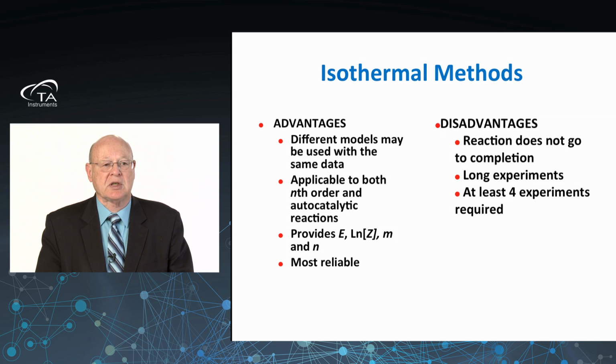Isothermal experiments will typically take about a day to perform for each one. We need at least 4, so we're looking at experimental times approaching a week or so.